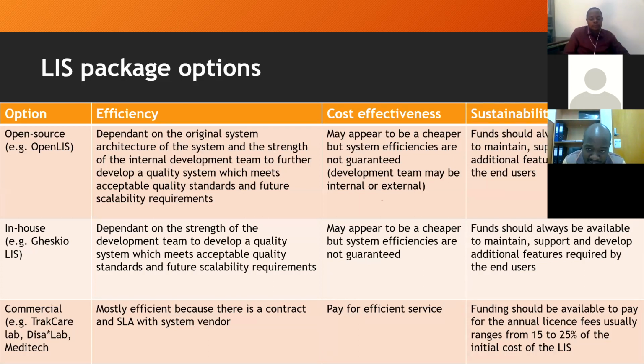So for sustainability, whether open source, in-house or commercial, funds should always be available, because with all systems, it's not like when you implement a system, that's it. Systems go through a life cycle where there are new features that should be developed. There's also day-to-day support and day-to-day maintenance of the system. So all that requires money. And when there's a new feature, there's training. So there should always be money available to sustain the product.